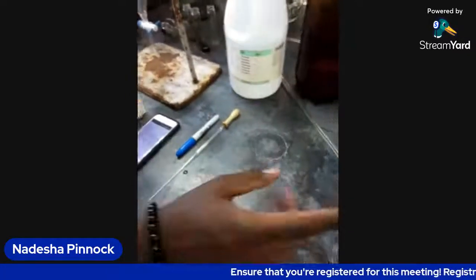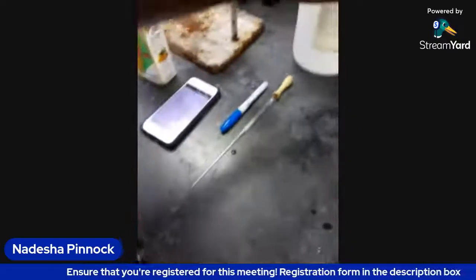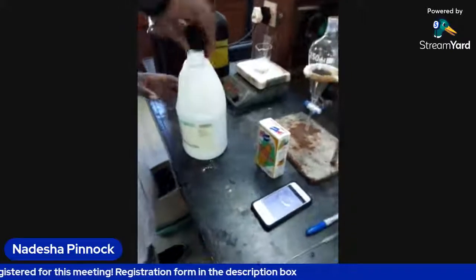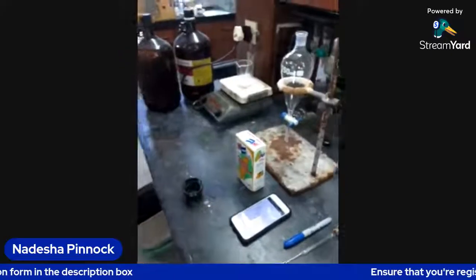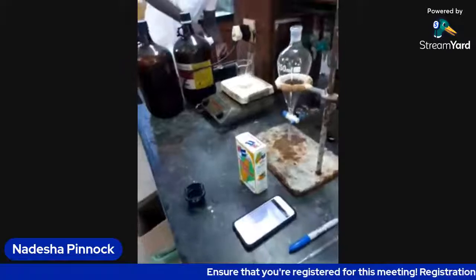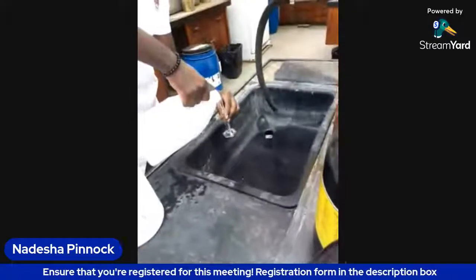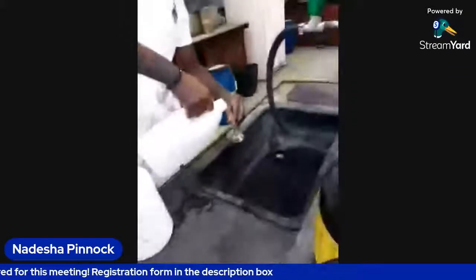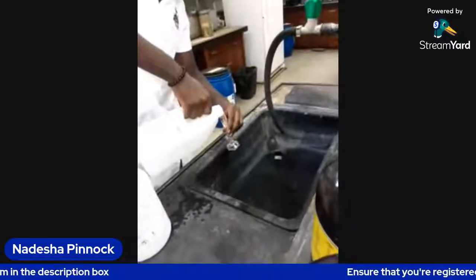So this is our glycerin, our glycerol, which is very precious. You don't want to waste it. So we're adding approximately 5 mils. As you can see, it's very thick and syrupy because it's concentrated. I mean, glycerol in general is thick.